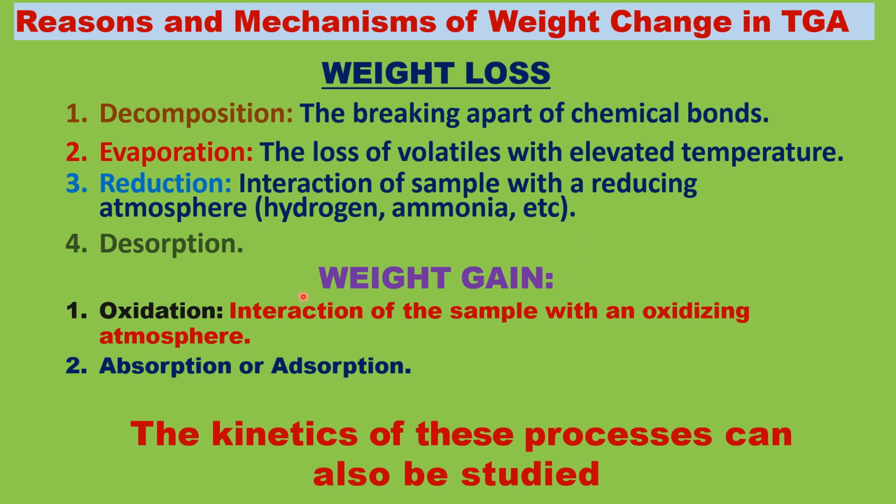Another case, the second case, is weight gain. A substance will gain weight when there is oxidation, interaction of the sample with an oxidizing atmosphere, formation of an oxide layer, or absorption, which results in weight gain in thermogravimetry.